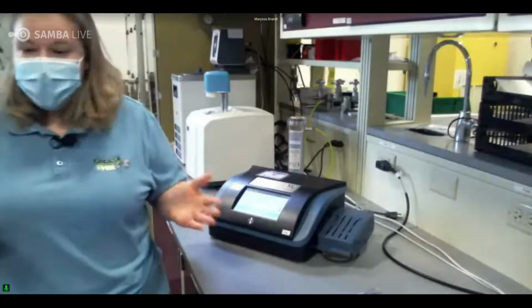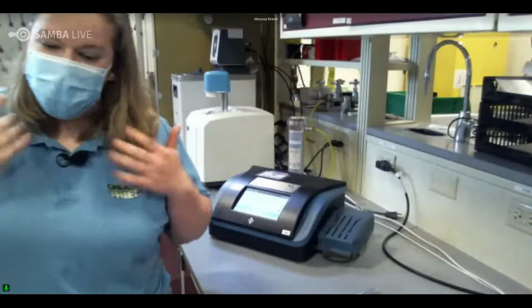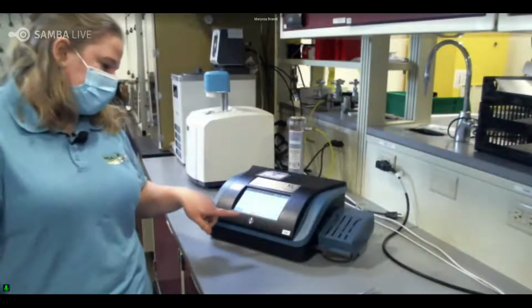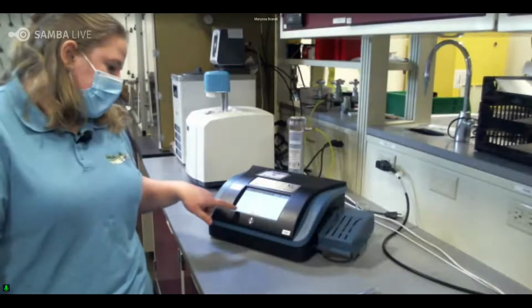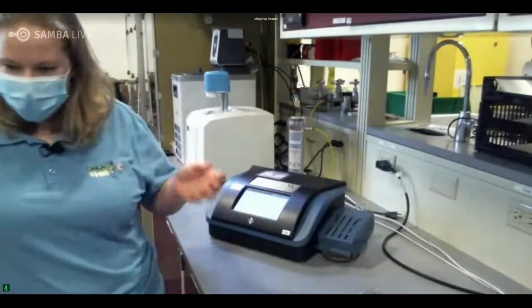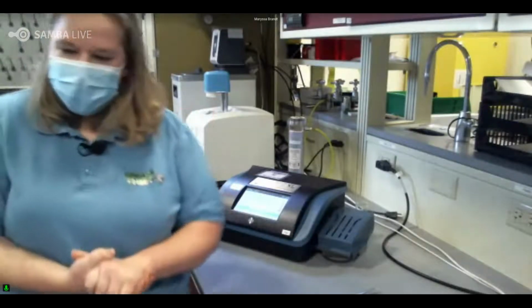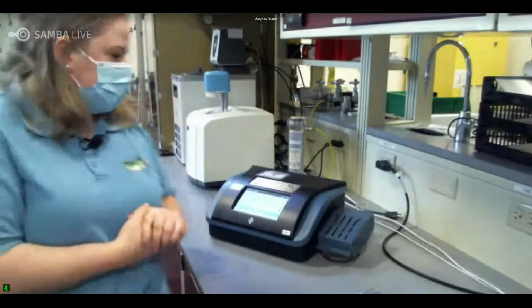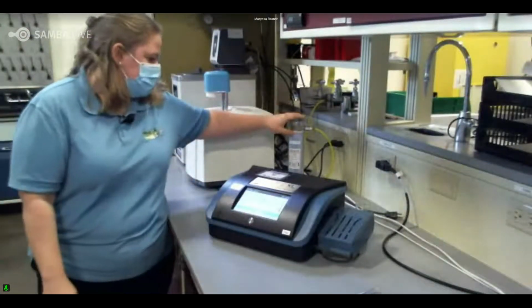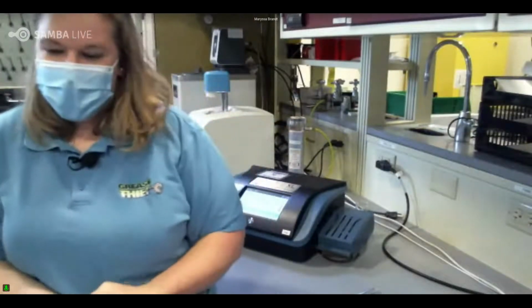So then this is again a set and forget it. So this is going to run, and I can go ahead and walk away. If I wanted to, I could sit here and monitor it. I can pull up a graph and see what the graph is going to look like at that time. I can also go back and look at sensors and see what my sensors are reading while it's running, if I would like to, or I can just wait for it to be done. So that's pretty much how the Vapor Pro works here. Back here you see we have our nitrogen source coming in and it's running. Are there any questions or anything at all I can answer?